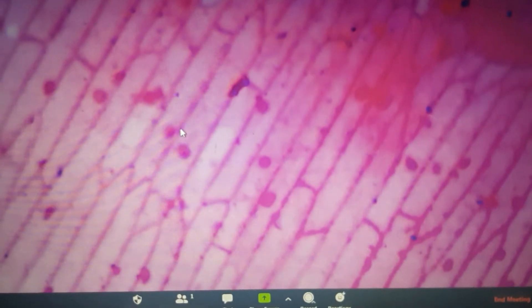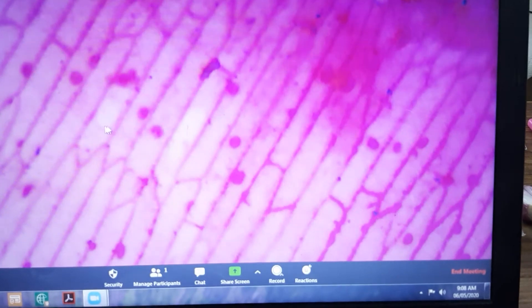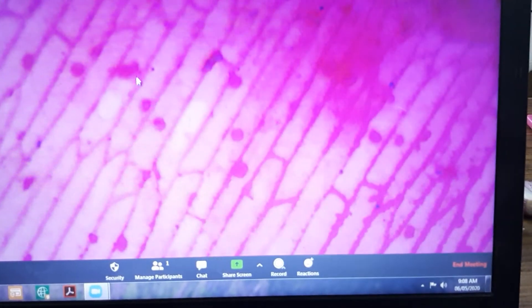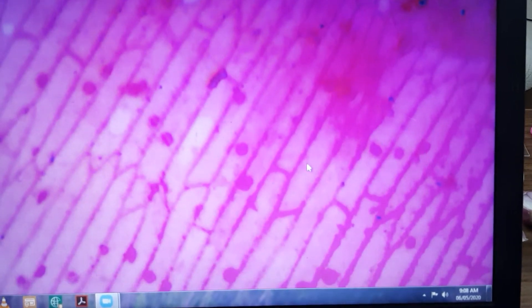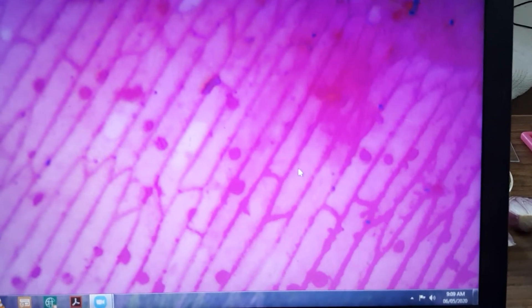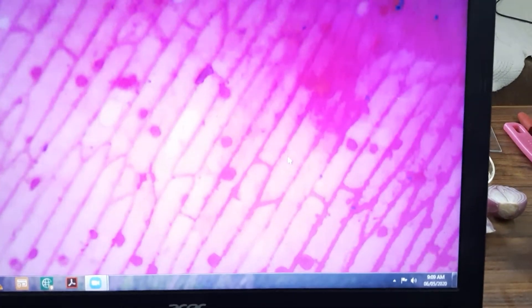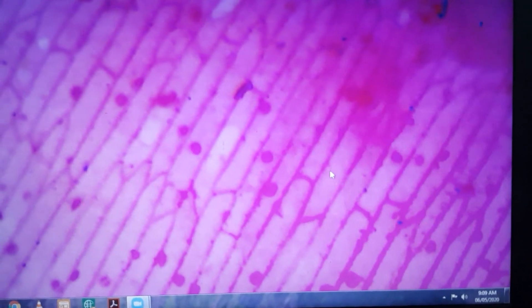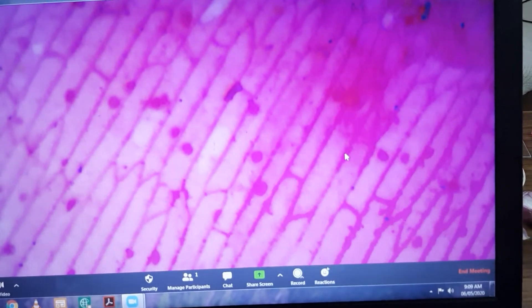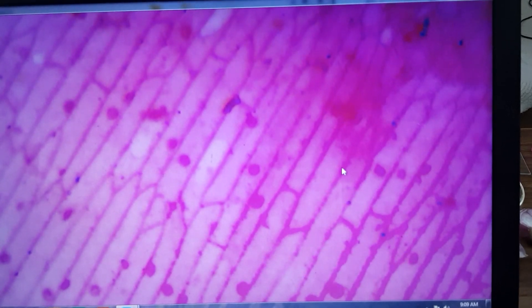The reason the nucleus is at one corner is the presence of the vacuole. The outermost covering is the cell wall. You can see a little bit of the vacuoles as non-staining areas, but if you want to study the vacuole structure clearly you need an electron microscope. Once your schools start you will prepare this temporary mount in the laboratory. After a few days I will show you another experiment on temporary mount of human cheek cells so we can compare plant and animal cells. Thank you and have a good day.